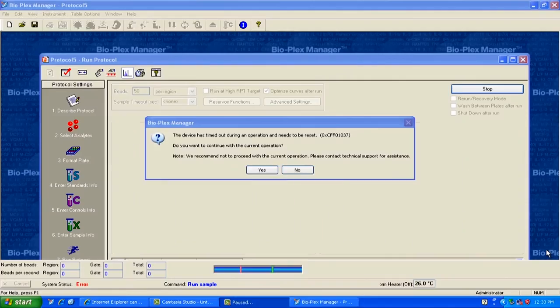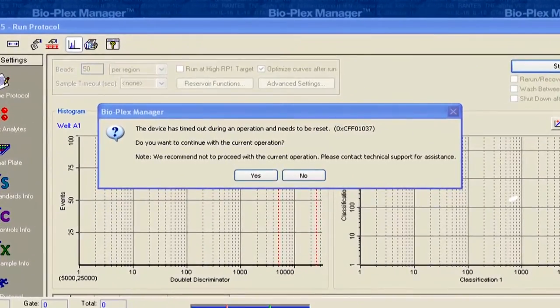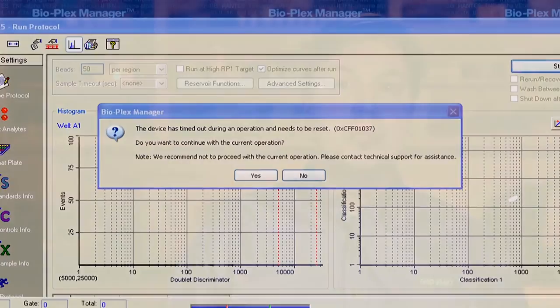During operation of the Bioplex system, you may encounter a timeout error message. This happens when the needle or probe cannot move to its proper location.